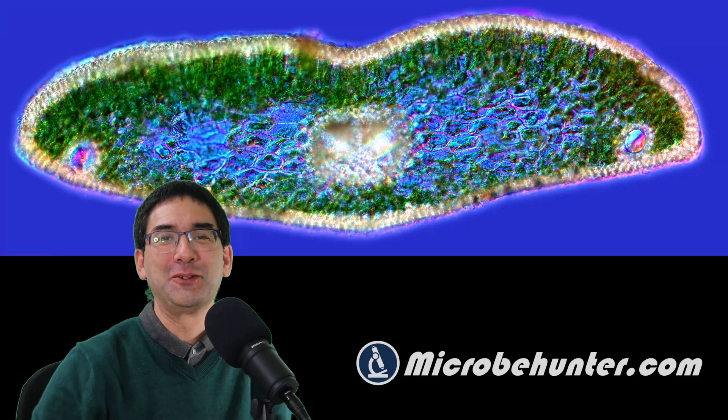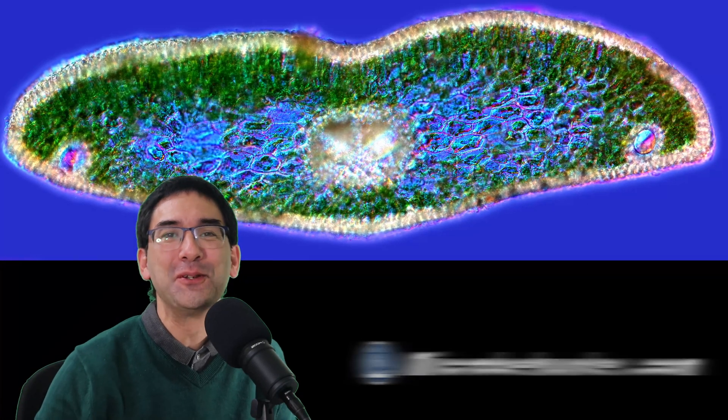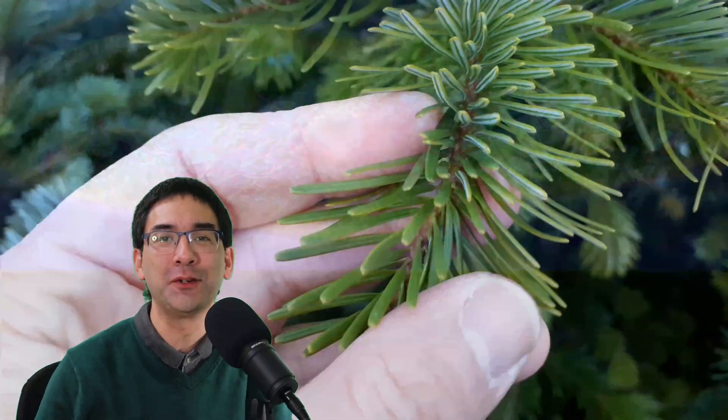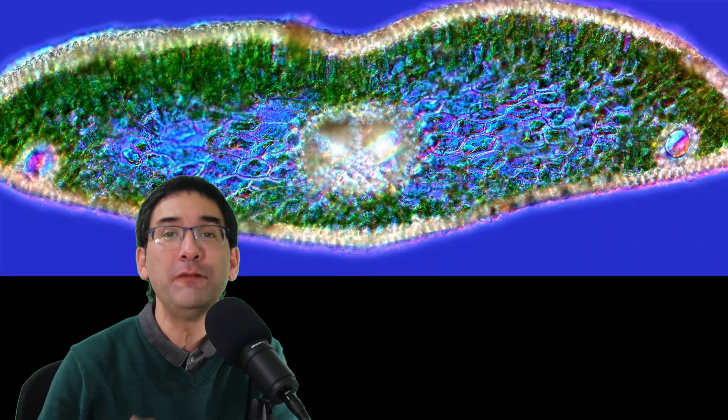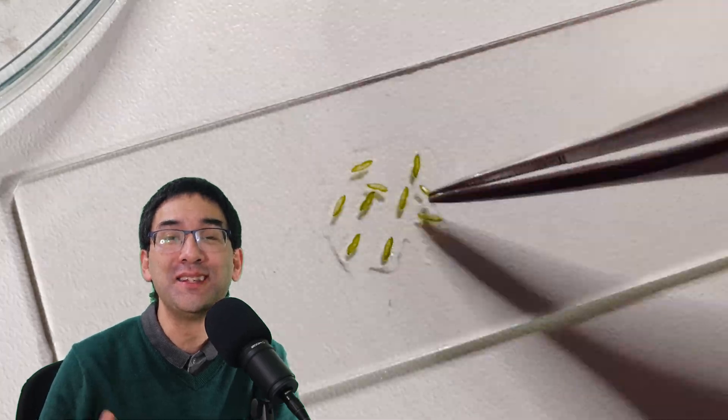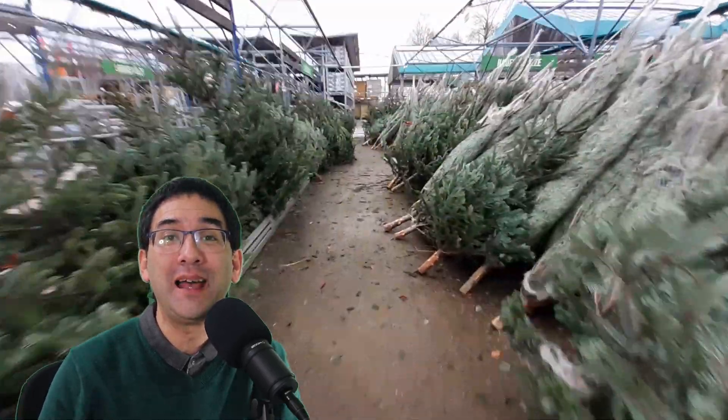Hi, hello and welcome — Microbe Hunter here. Today I'm going to put a Christmas tree under the microscope. Well, of course not the whole Christmas tree, but rather the needle or leaf — specifically from a fir tree, Abies nordmanniana.